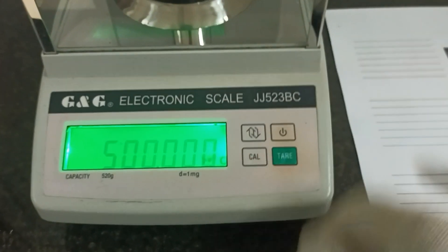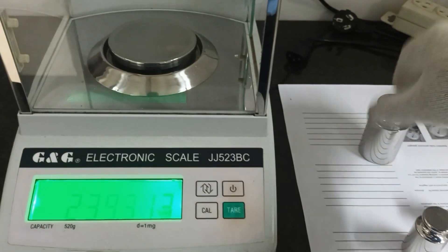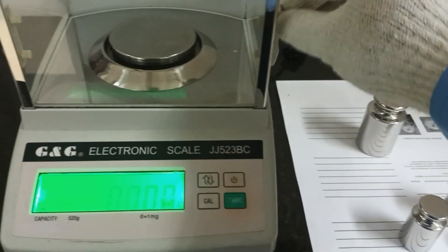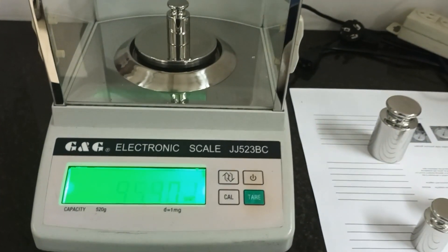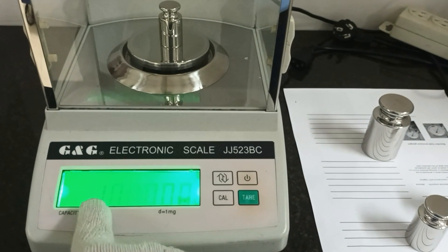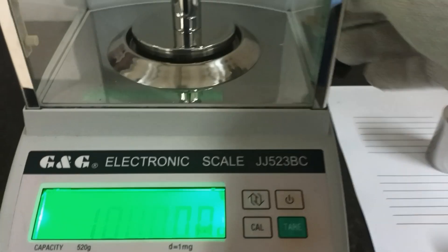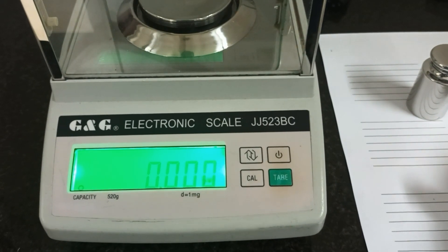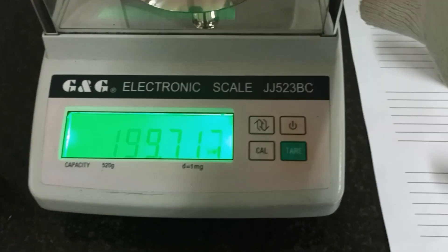After the calibration finishes, I will check the standards. First, I will check 100 gram — okay. One more, I will check 200 gram — wait, okay. 200 gram is okay.